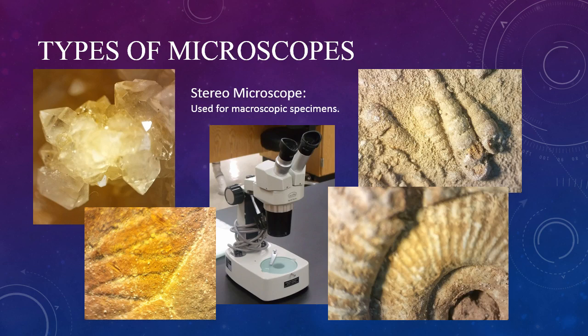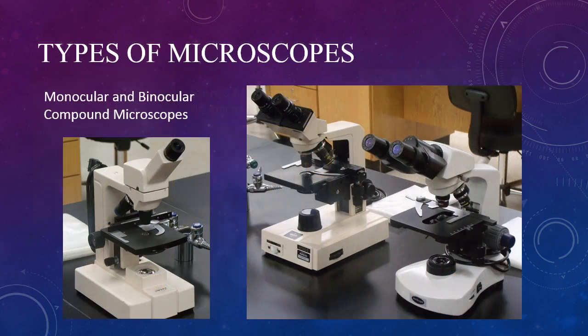This is a stereomicroscope. It is used for larger-scale specimens, perhaps an insect, or as is shown here, minerals or fossils. These are compound microscopes. They're called compound microscopes because they have multiple lenses.